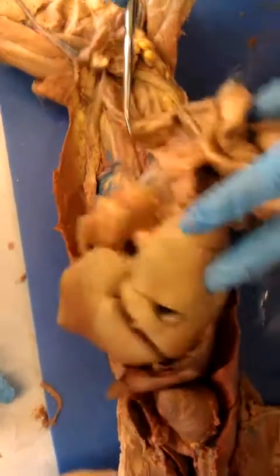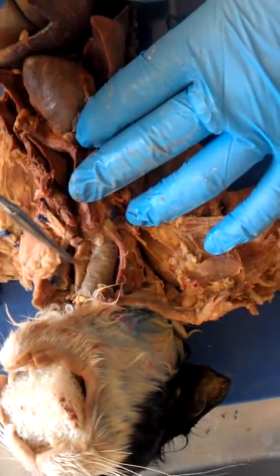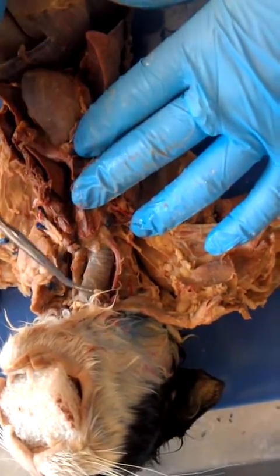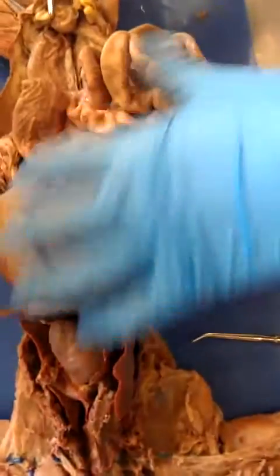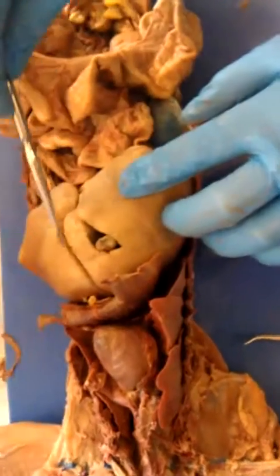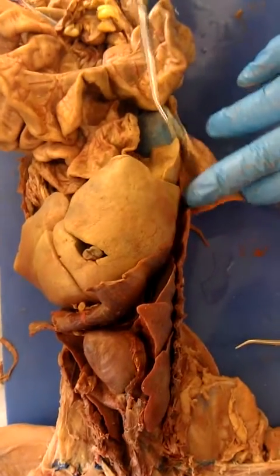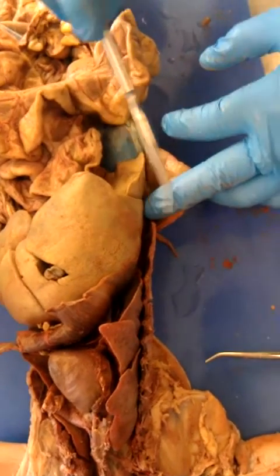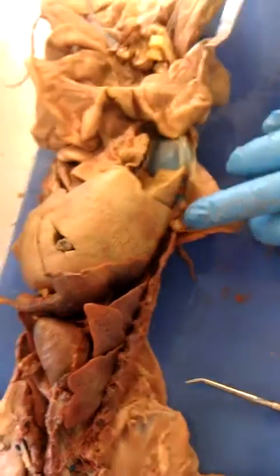The esophagus is right here. This one right here. And this is the trachea right next to it. And then the gallbladder is this body right here within the liver. This is the liver, the different lobes of the liver. This is the right side, right? Mm-hmm. So this is the right lateral, right medial, left lateral, and this is the caudate, just so you know.